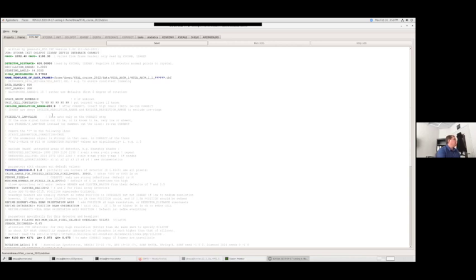Okay. And then if we have an idea of high resolution, we can put that in. Otherwise, it's going to go from the center of the detector out to the region defined by the trusted region that we see below. Okay. If you put 0 in, it just does the entire trusted region.